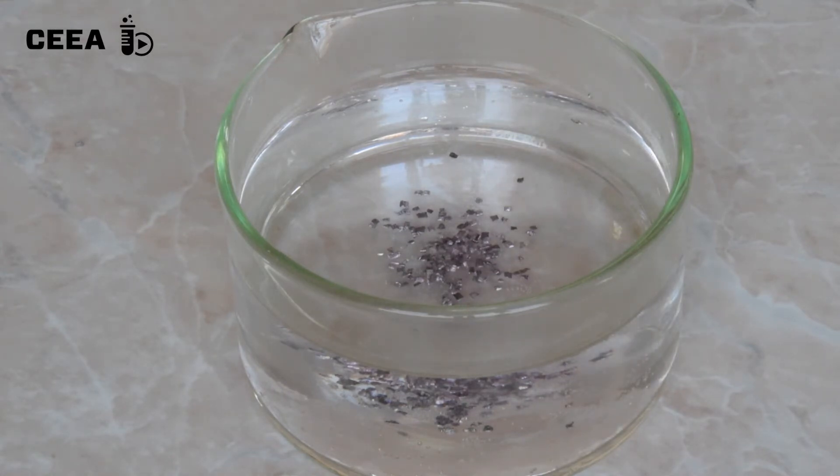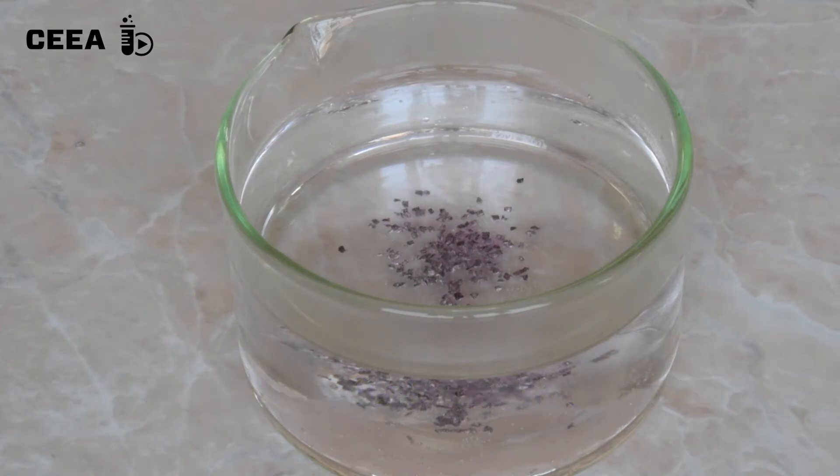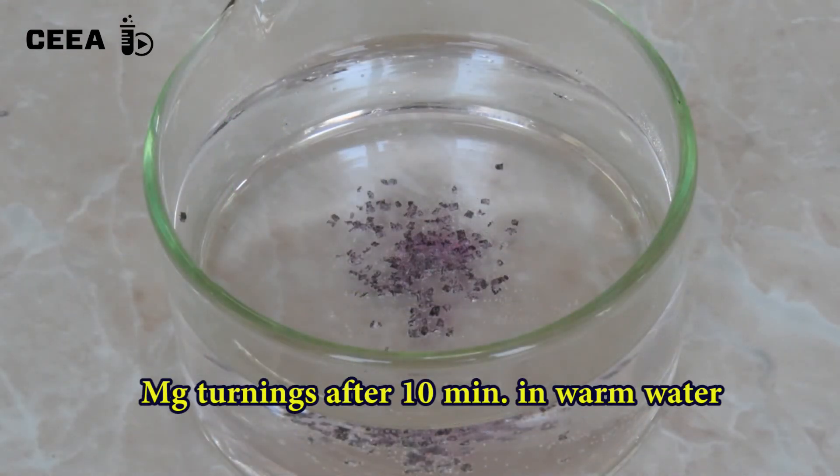The reaction rate is very low. See the reagents after 5 minutes and see the reagents after 10 minutes.